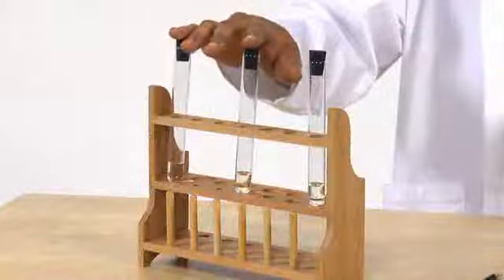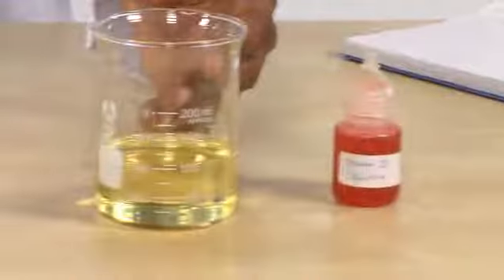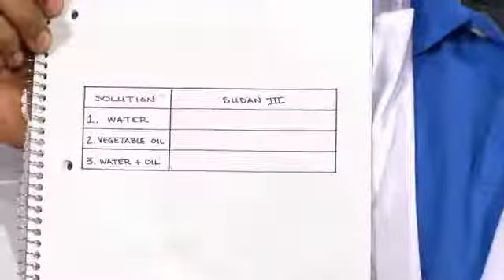3 test tubes and stoppers and a test tube rack, a wax pencil, water, vegetable oil, and Sudan 3 dye solution. We're going to use the Sudan 3 dye to identify which liquid is a lipid. Say that 3 times fast. The Sudan 3 solution will mix with a liquid lipid. We'll also need to make a data table like this one to record our findings.